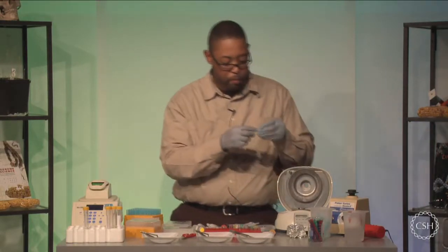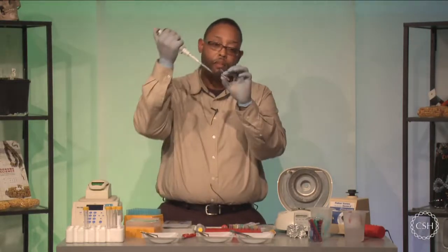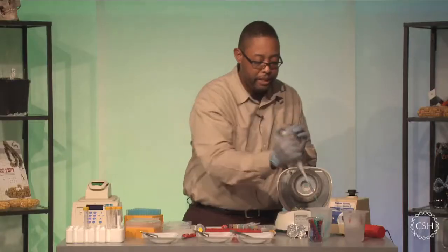So I'm going to take sample number one, and what I want to make sure of is that I go in there with my large pipetter, draw off all the liquid, as much as I can get. Remember not to disturb the pellet.